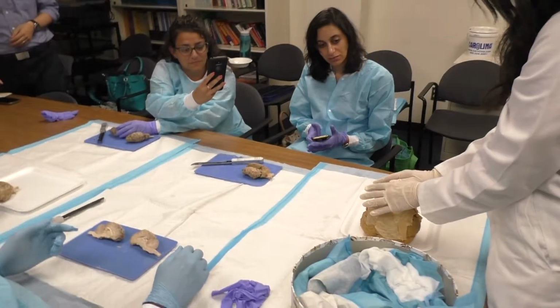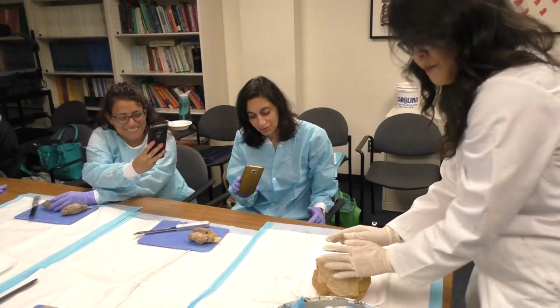I don't want my precious brain banging up on the skull. Do you want me to take a picture?